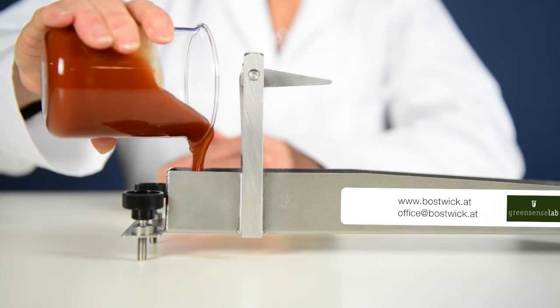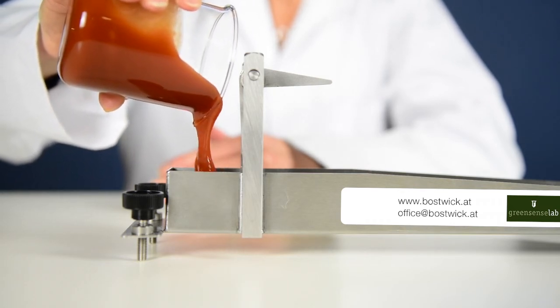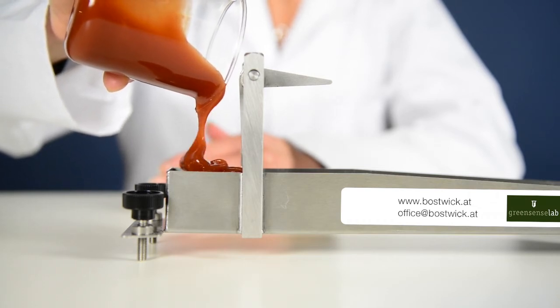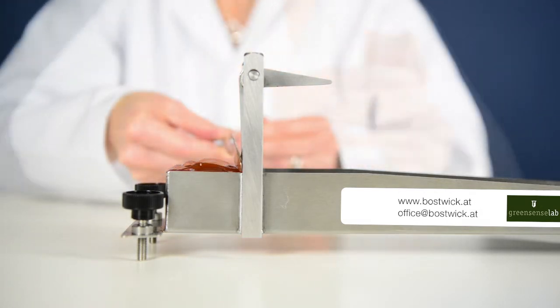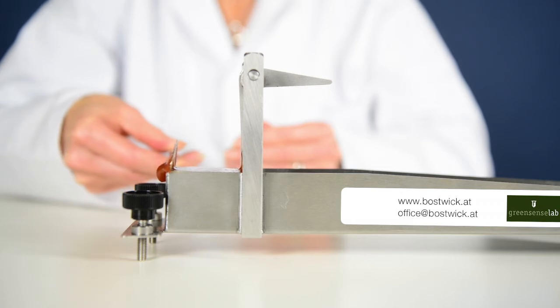Pour the sample into the reservoir. I'm now ready to run the test with my 75ml sample.